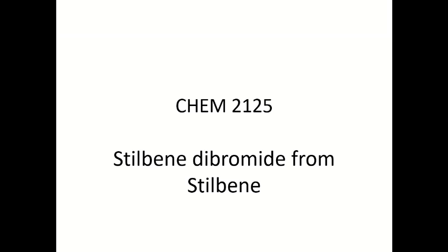Hello, welcome to the organic chemistry lab. Today we are going to study the synthesis of stilbene dibromide from stilbene.